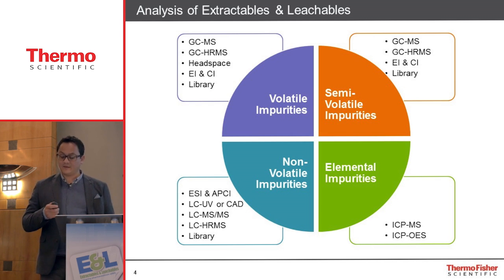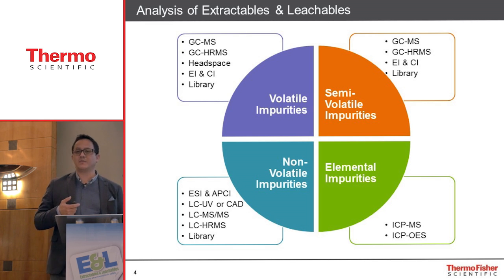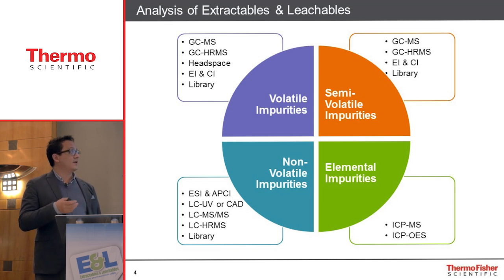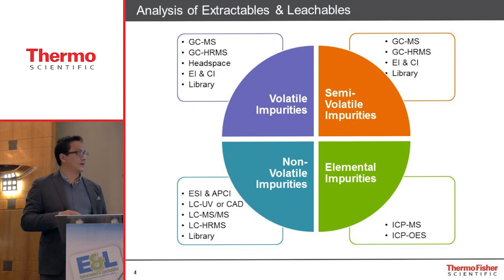And I think it's fairly safe to say that conventionally, mass spectrometry has really led the way in identifying unknowns. And as instrument vendors, we recognize that many people within the industry have reached out to us in the past requiring additional capabilities. So there has been a general movement from mass spectrometry to high-resolution mass spectrometry, both for LC and GC amenable compounds, often complemented with orthogonal detection such as UV, or more frequently today we see charged aerosol detection as a universal detector for unknowns.